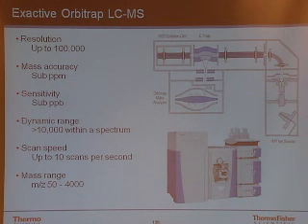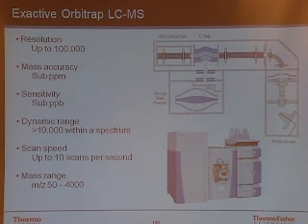So far, it looks like a triple quad mass spec, except the products of the collision or the secondary ionization are then brought back into the Orbitrap mass spectrometer. And time does not allow me today to describe Orbitrap mass spectrometers, but they take an elliptical path down through that tube, and they cycle forwards and they cycle backwards, and they wait until their molecular weight is called, and then you go out to the detector.